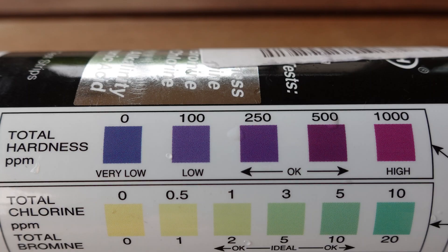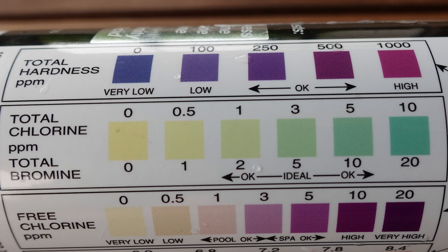First, we'll take a quick look at the 7 measurements that the AquaCheck 7 strips provide. At the top is total hardness of the water, which equates to calcium hardness on the pool supply store report. The second test area on the strip provides two measurements: total chlorine and total bromine.